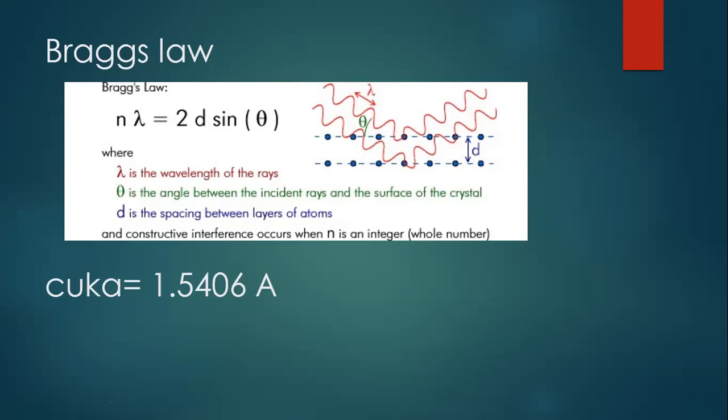So what is the meaning of Bragg's law? It means that the X-rays are scattered from a crystalline lattice, and the peak of the scattered intensity will be observed. In this case, we have two conditions for Bragg's law: the angle of scattering and the path length difference. This is the condition for maximum intensity, which lets us calculate details about the crystal structure.